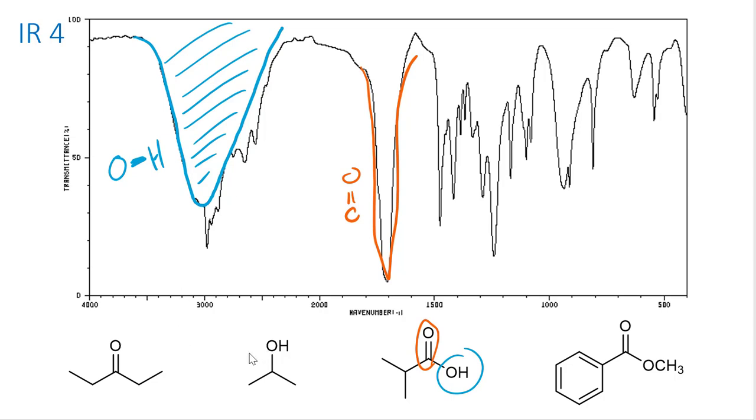Now notice that in this spectrum we have a fairly extended series of smaller jagged absorbances that are sp3 CH bonds. They're mostly to the right of 3000, which again is where we typically see the sp3s. And when we look at these two absorbances, we're really looking at the sum of them.